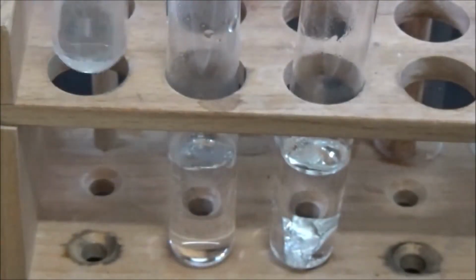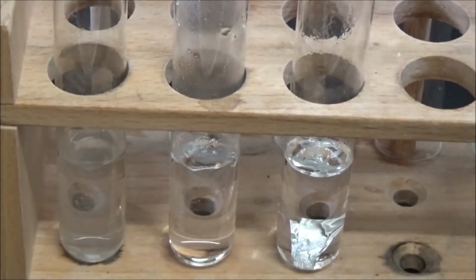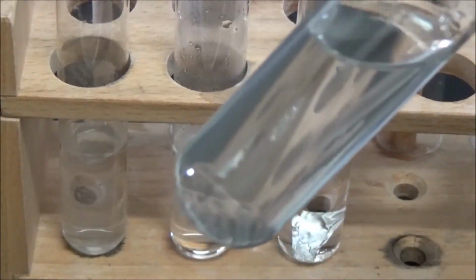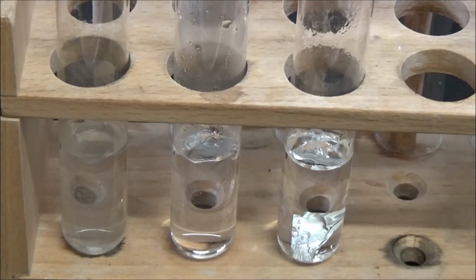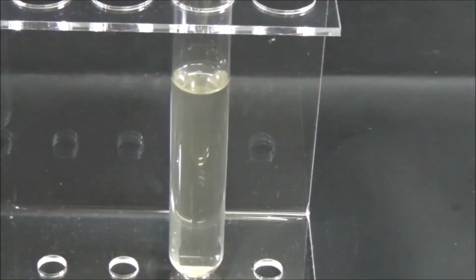On the other hand, diluted sulfuric acid reacts with aluminum only with great difficulty. Diluted acetic acid practically does not attack aluminum even when it's hot. Aluminum has a passivating oxide layer that protects against the effects of diluted acids, but is dissolved by alkali hydroxides.